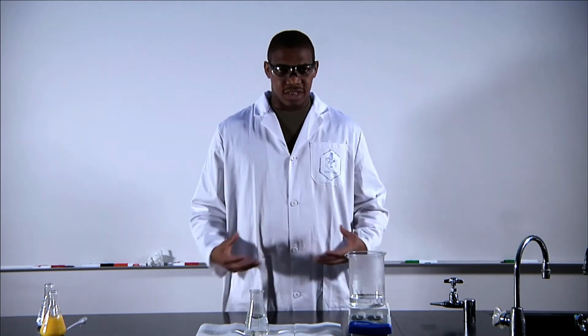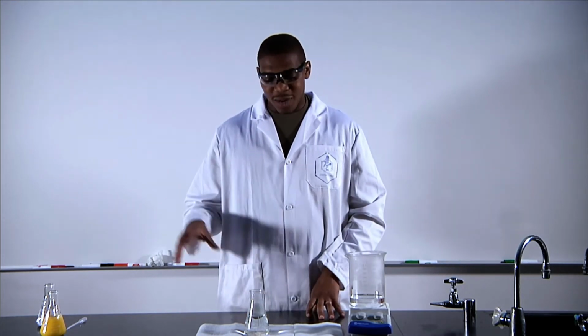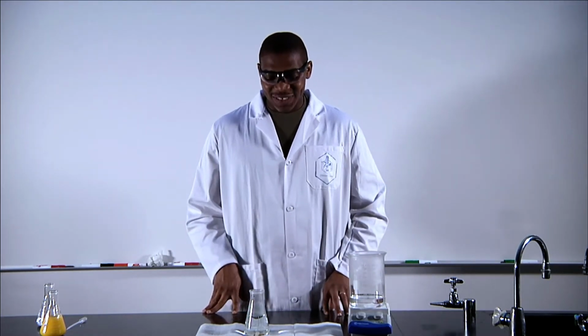Now, if we were to let it sit here over time, we'll watch it start to precipitate back out, what we like to call golden rain. And again, hopefully this explains to you the concept of solubility rules and precipitation and how that all comes into play. I'm rambling now. I'm just going to let this run here. Hopefully you're just looking at that and not my hands.